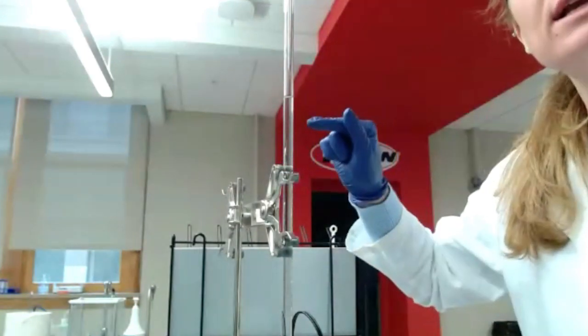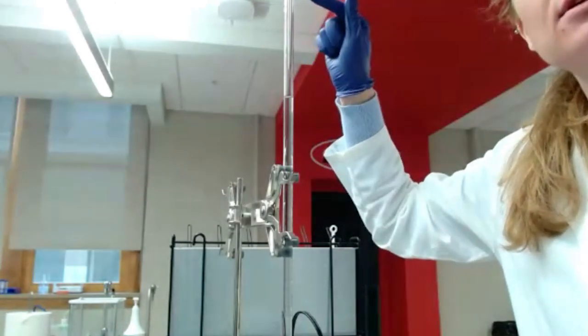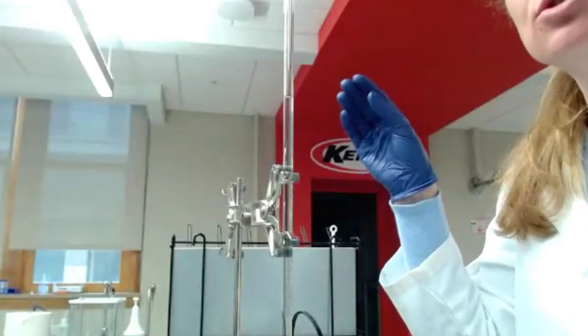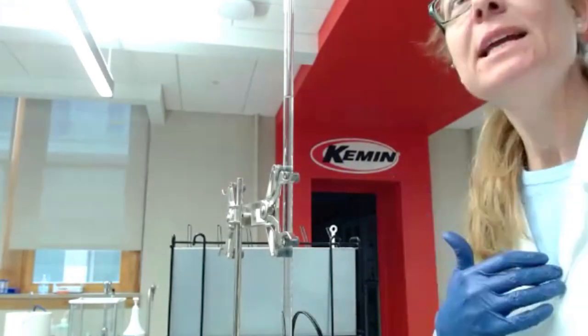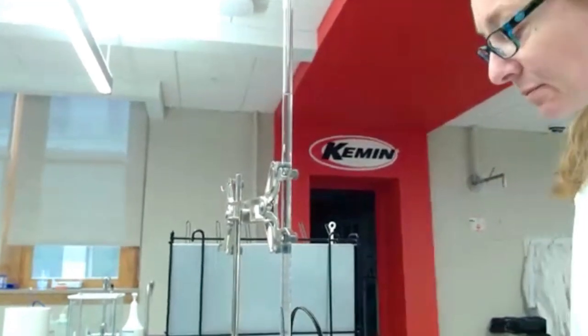Sometimes you will have 24, 25, 26, 27 the other way around. So make sure when you read the initial volume, you read correctly. I'm going to record 24.1. That's my initial volume. Make sure you record your initial volume.